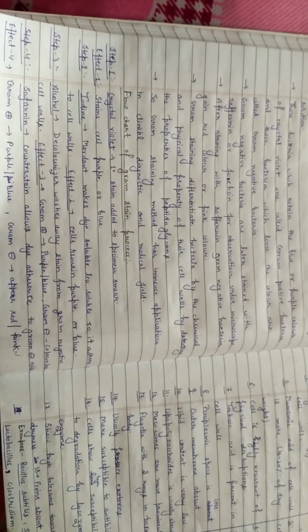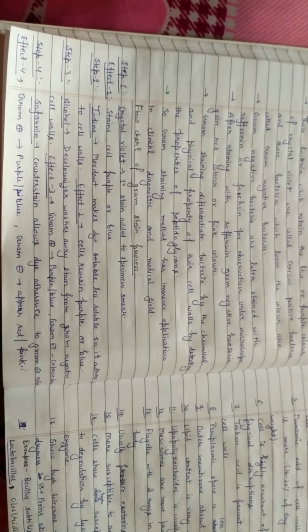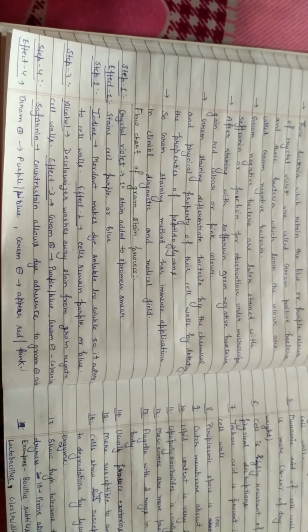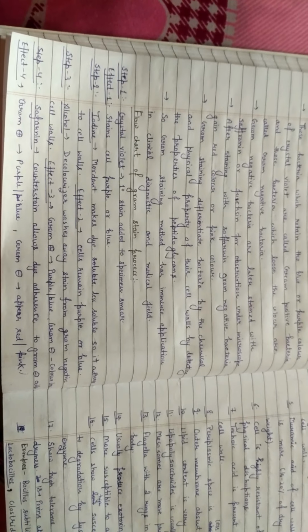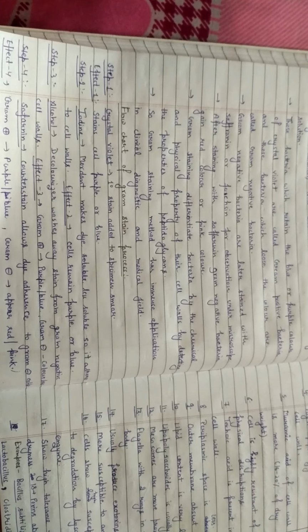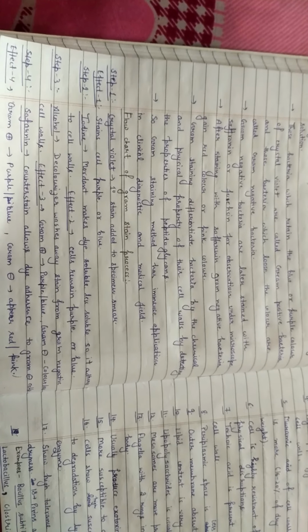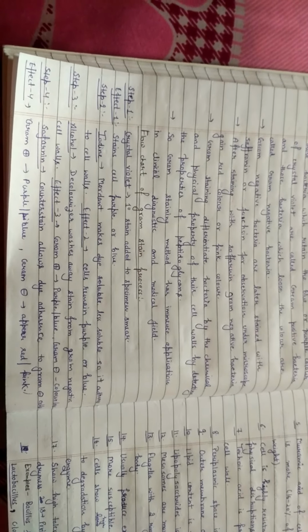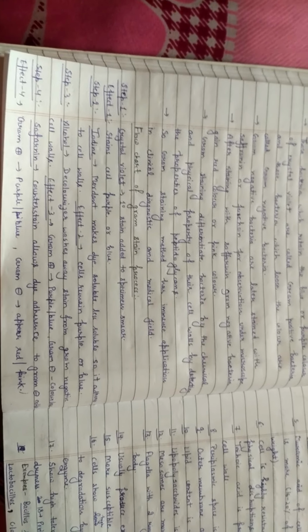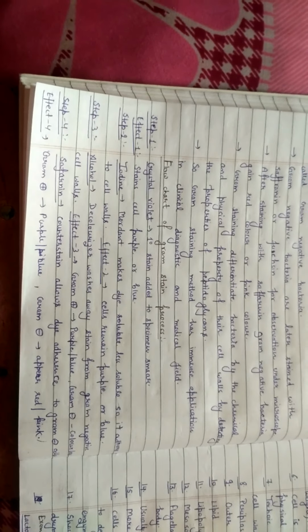That's why gram-negative bacteria become colorless, but gram-positive bacteria remain purplish or bluish in color. There is no change in the cell wall of gram-positive bacteria. Because it retains the crystal violet stain, it is called gram-positive. And gram-negative bacteria wash away the stain, that's why they are known as gram-negative bacteria, and they become colorless after treatment with alcohol, because alcohol acts as a decolorizer or destaining solution.